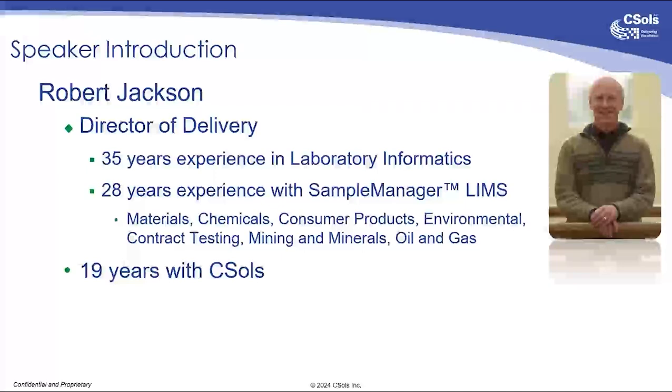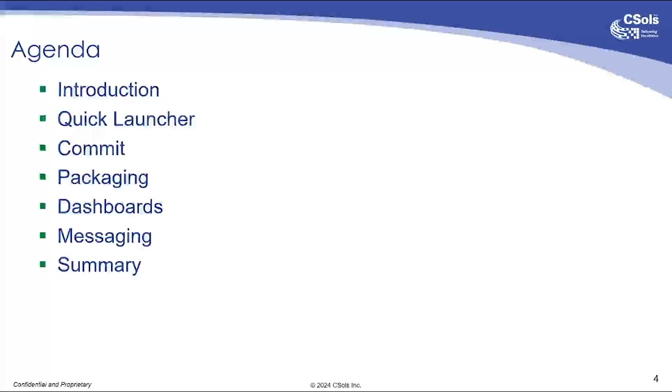So today we're going to talk about five relatively, well, I guess some are a little bit bigger than others, but five functionality areas which are often neglected but do offer a lot of potential for doing interesting things with. So I learned a fair amount while doing this webinar, lots of interesting little details about some of these which I wasn't completely aware of before this was put together.